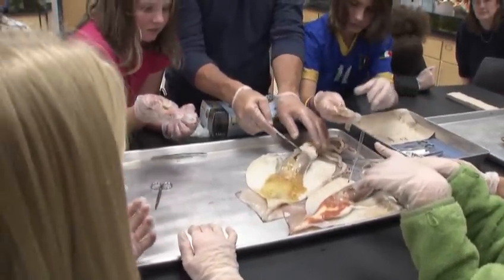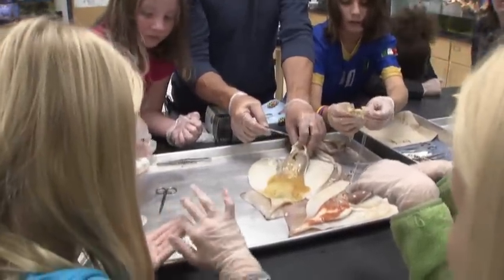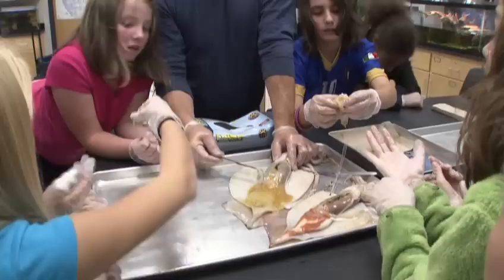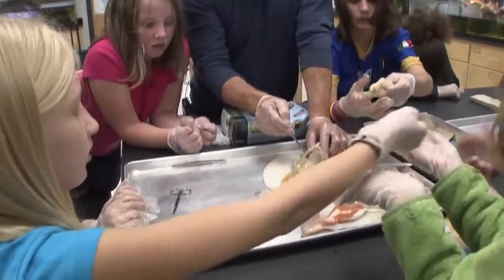What's this? Now here's your rectum, and it blows out right here. Look, see? Can you cut open the rectum? The rectum's right here. No one cares about the rectum. And then the gland. And we're going to cut this open, and I have some crackers. So if you guys want to dip in here, let's see what this looks like.